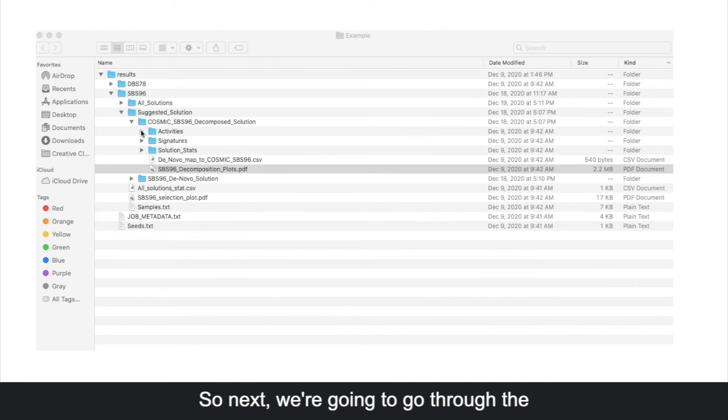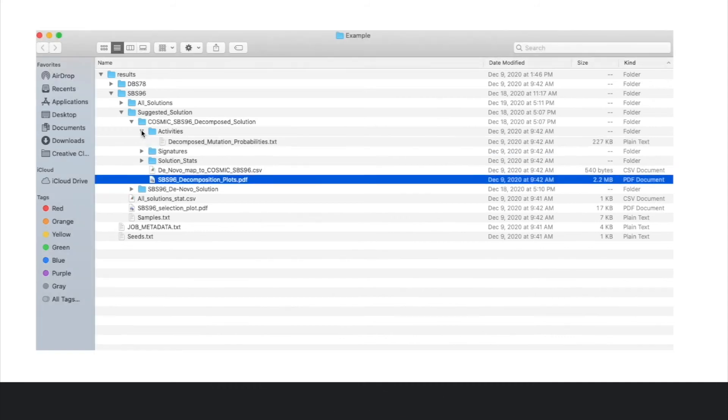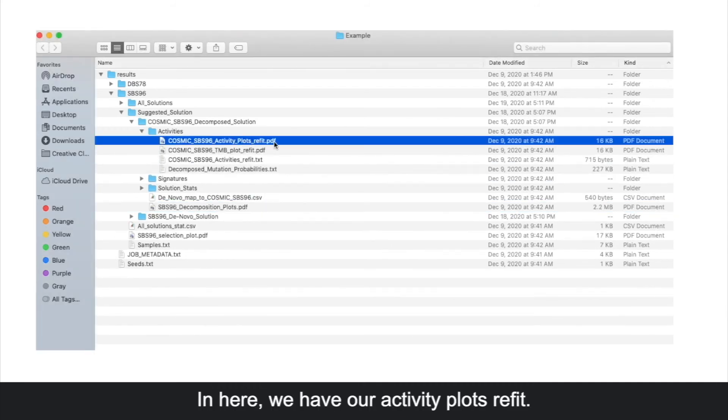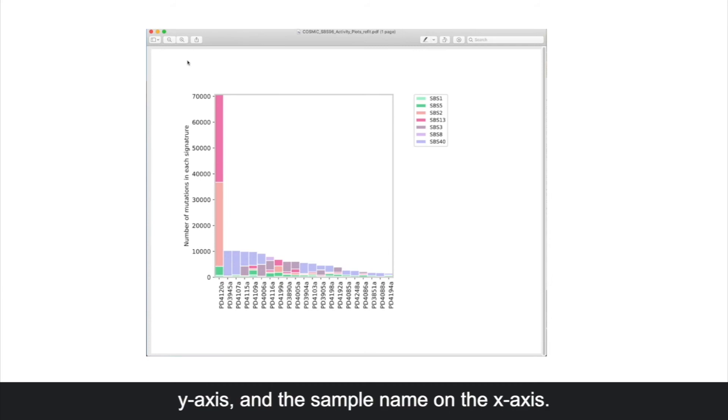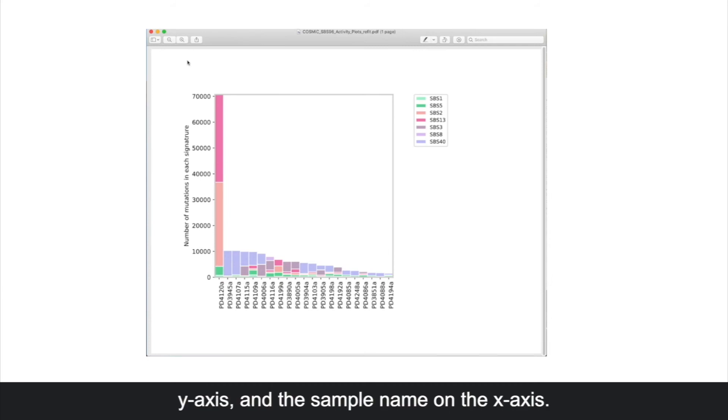Next we're going through the activities directory. In here we have our activity plots refit. This plot shows the number of mutations in each signature on the y-axis and the sample name on the x-axis. The colors indicate which signatures were found in each sample.